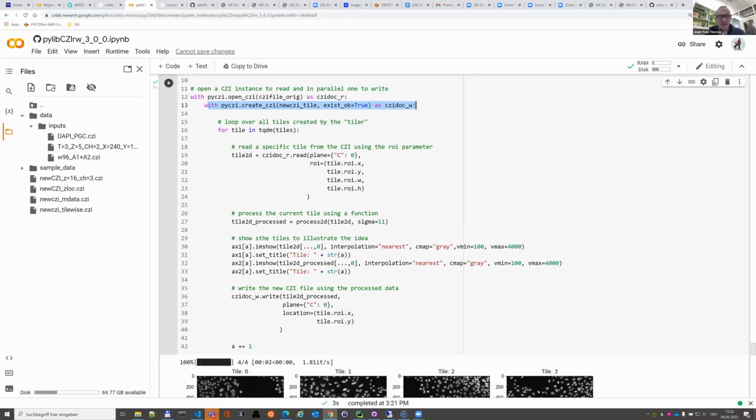Hello, Sebastian. Thank you so much. The one thing I was thinking of is that, for instance, when you take a small tile and filter it with an aggressive Gaussian filter, the pixels on the border of the tile are going to be probably averaged with black. Okay, I know what you mean.